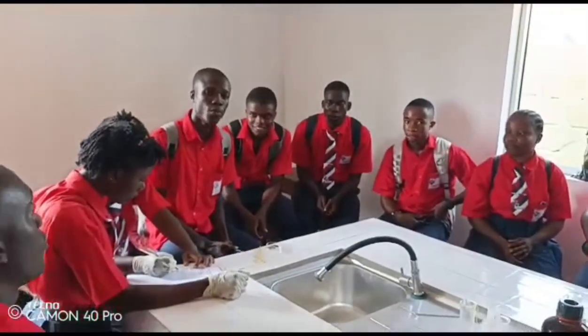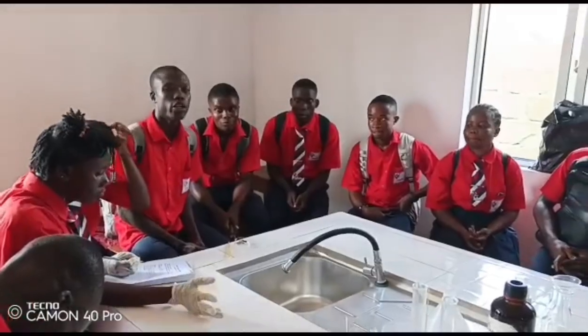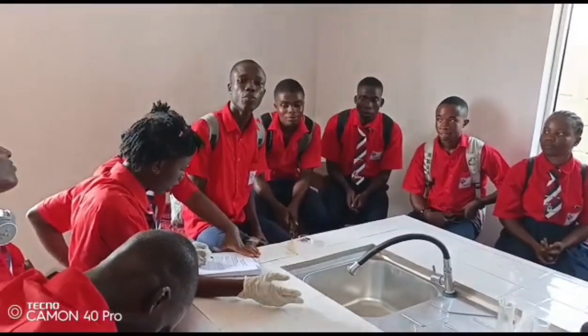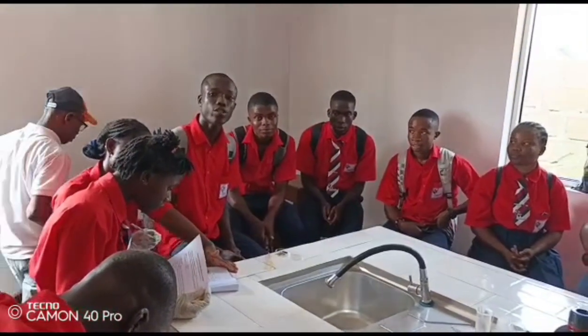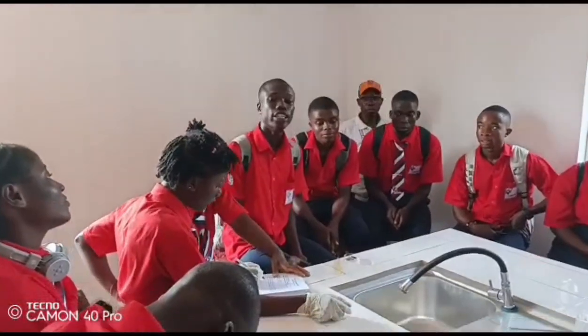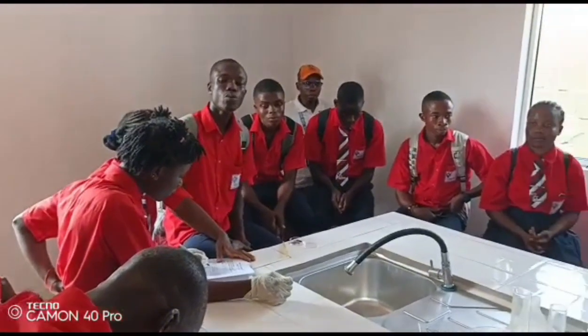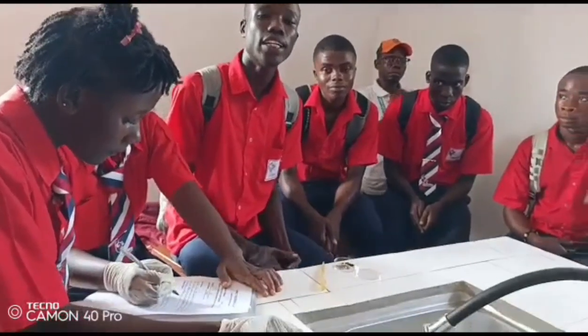We, the members of Group 2, today represent our town in the lab, and we were told to bring a material that we will test to understand whether these foods are starchy or non-starchy. One of the foods we tested here today was curry and water. We observed that when the iodine was placed into the water, the iodine maintained its color. We didn't observe any change, which shows that water is not a starchy food.